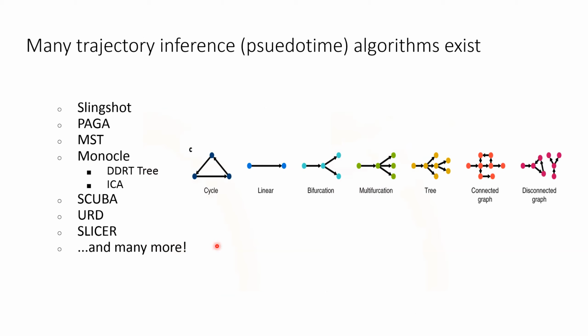So again, there are many different kinds of pseudotime algorithms, but they mainly differ in the structure of the graph that's allowed to be built. So here's an illustration of what I mean by this. Some trajectory inference algorithms impose a linear path along data, while some allow for bifurcation and some allow connected graphs or loops, which you can consider to represent the process of transdifferentiation, where one cell type reverts back into a different cell type without following a linear differentiation path.